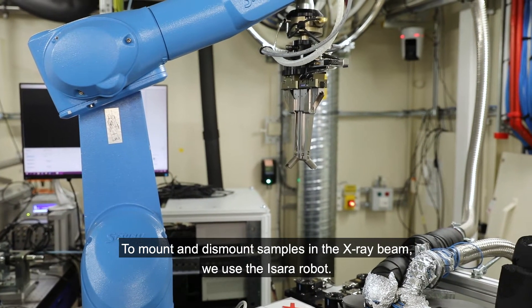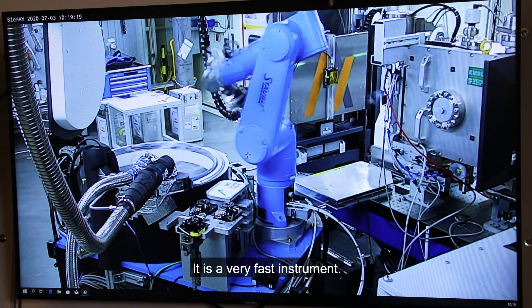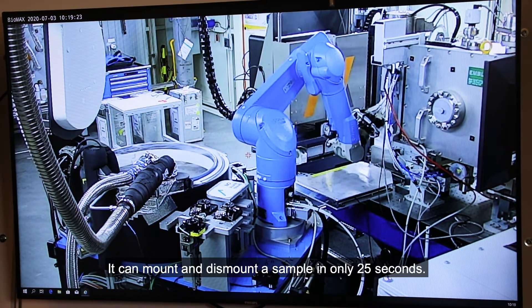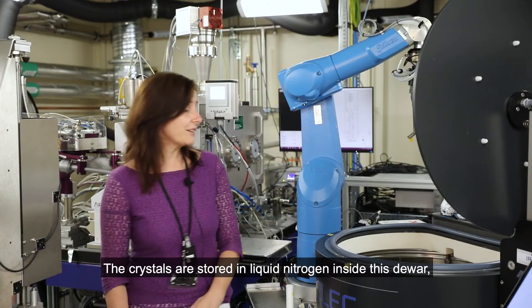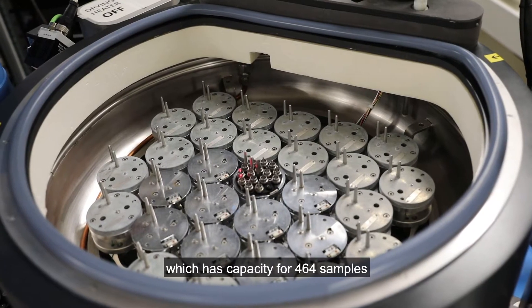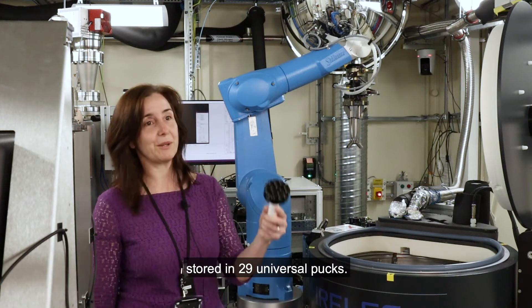To mount and dismount samples in the X-ray beam, we use the Isara robot. It's a very fast instrument — it can mount and dismount a sample in only 25 seconds. The crystals are stored in liquid nitrogen inside this dewar, which has capacity for 464 samples stored in 29 universal pucks.